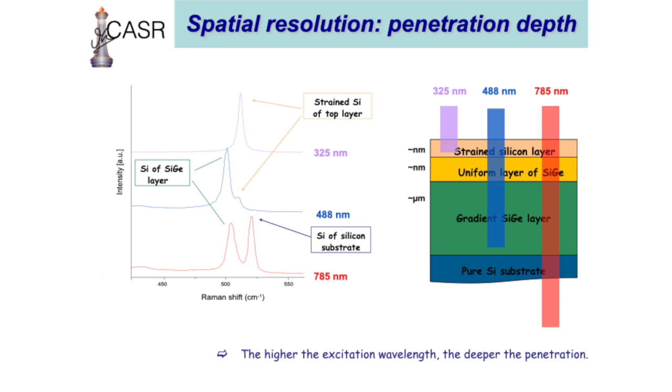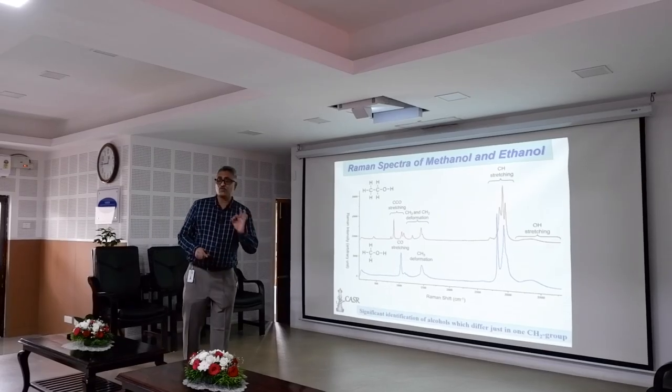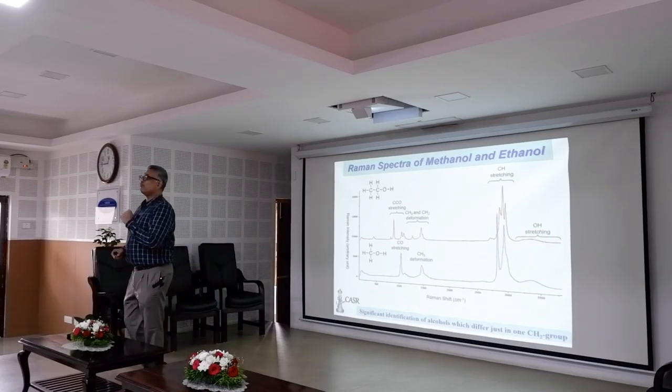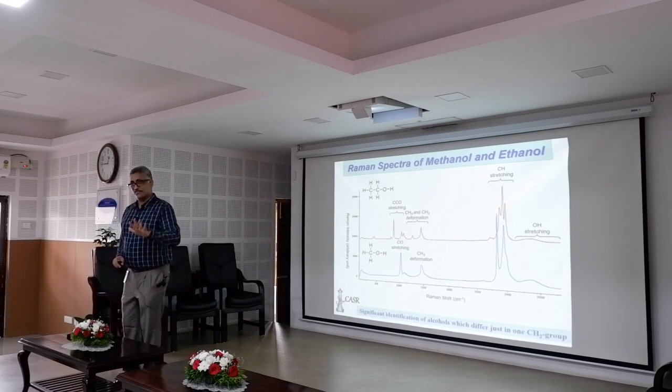So, you need to actually understand, if you are having some layer, something sitting on the top or something in the middle, which is the one which I can use for looking at these kinds of spectrometers. So, tissue imaging or in materials imaging, all of these things can be done by the Raman. Okay? So, now finally, I'll tell you how beautiful the Raman is, and I'll stop with that. Four slides and I'll stop.